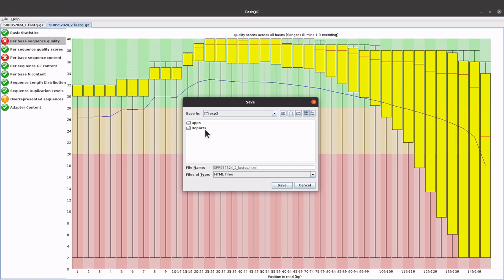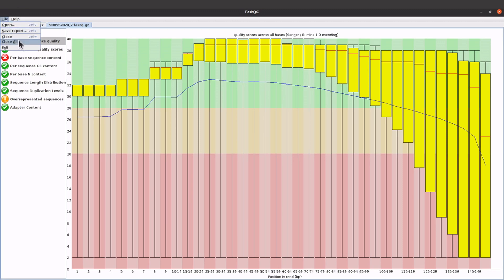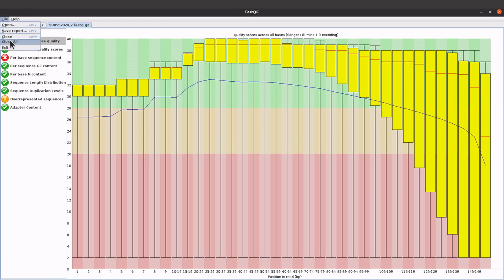Now you can close it. You can close it here. You can also come to File and then close. Close all or close. If you go to close, it will close the current window. Close all will close everything. Or you can just also use this, or you can use it here.